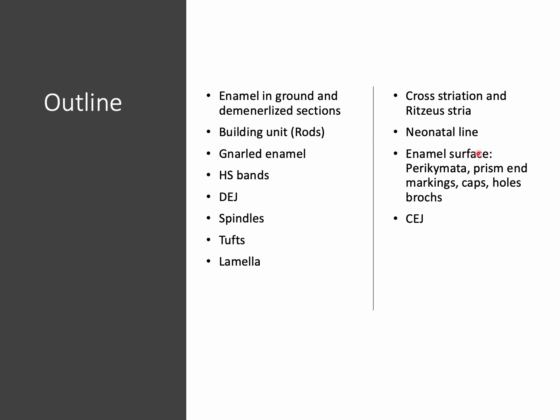And finally, we are going to see the enamel surface and all the features that we can see on the enamel surface, including the interface of enamel with cementum that is called the cemento-enamel junction.